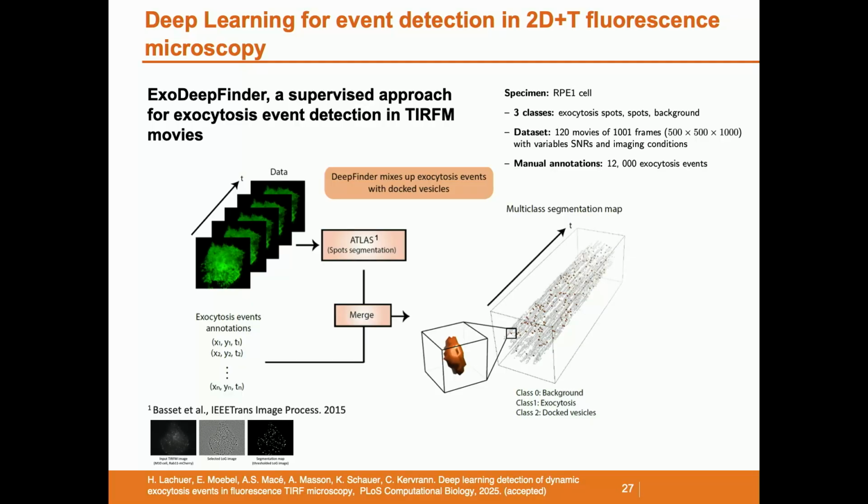Right. The main reason is that you have to detect only one pixel in one image, not more, and CNNs are not appropriate to do that. To detect nothing is very hard. So I have to detect very rare events. But from the experience with DeepFinder, we know that it's easier to detect very rare macromolecules if you consider several classes at the same time.